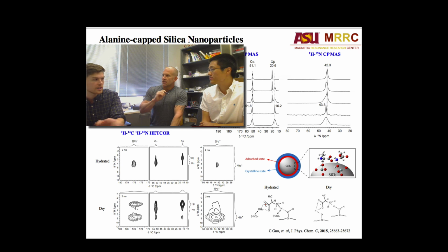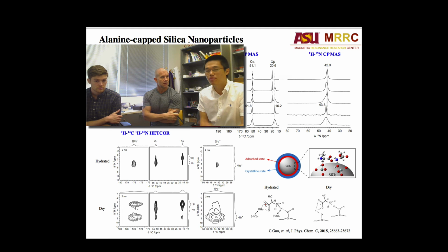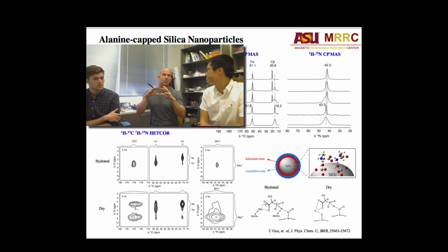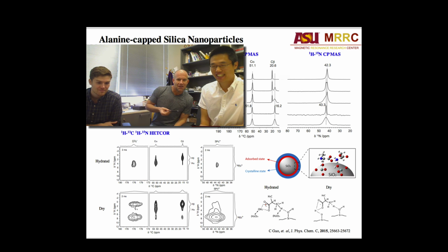So then these you say are just hydrated. Hydrated means like what? I mean, dry means vacuum oven dried? Yeah, the hydrated sample here is that we only vacuum dry the sample for a day, but for the really dry sample, we actually pump the sample for half a month. Oh, wow. So basically these are both white powders. Yes. It's just one you haven't pumped for forever to get all the bound waters out of it, and another one you really pumped until you could get every little bit of water out of it. Okay, that actually helps a fair amount in understanding this.